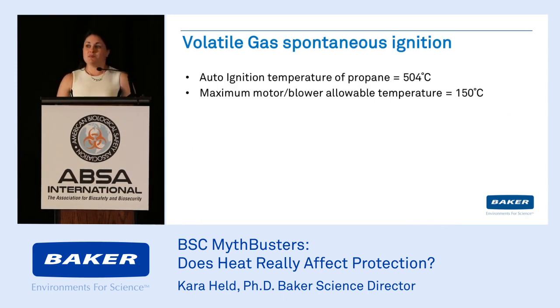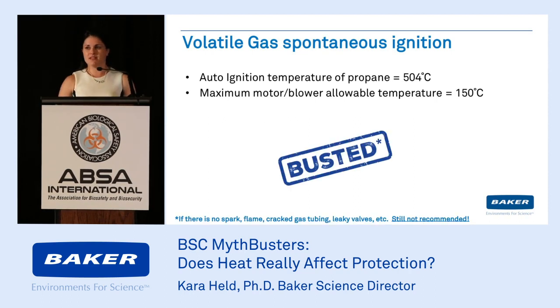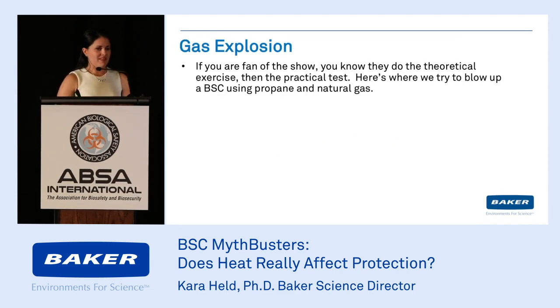All right, now moving on to the spontaneous ignition. If you have the gas flowing around a hot motor, would it actually ignite on its own? The auto-ignition temperature of propane is 504 degrees Celsius. The maximum allowable temperature for a motor blower is only 150. So this myth would be busted, with that asterisk, if there's no spark, flame, leaky valves, cracked tubing, etc. So please don't put gas in a biosafety cabinet.